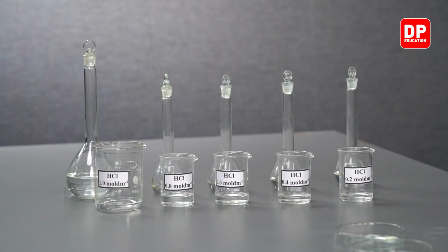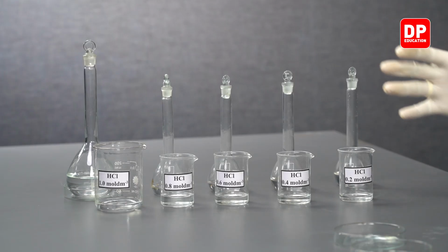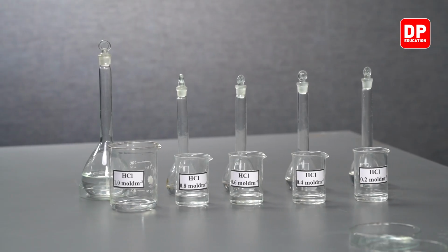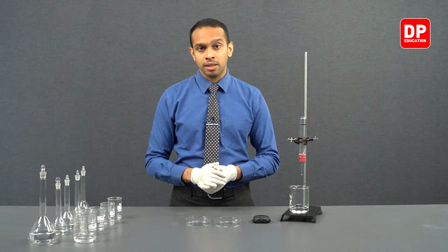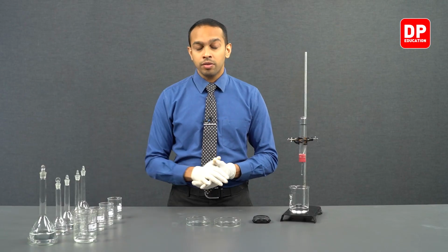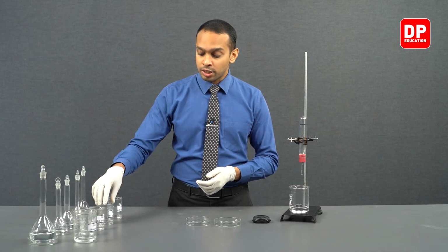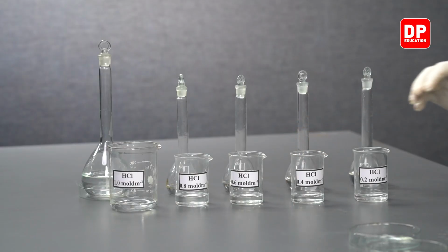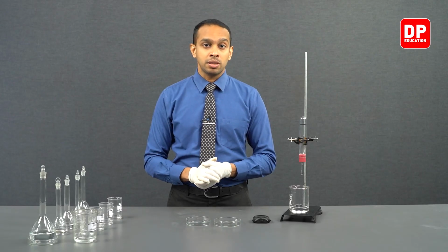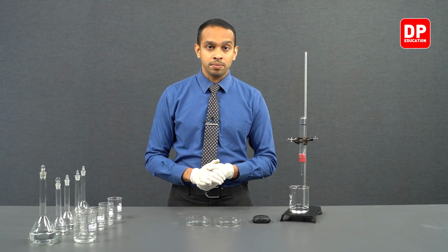When we had 0.2 moles per decimeters cube concentrated HCl reacting with magnesium, we saw it took over 5 minutes and 30 seconds. And then when it was reacted with 0.4 moles per decimeters cube concentrated HCl, it took only 1 minute and 30 seconds.